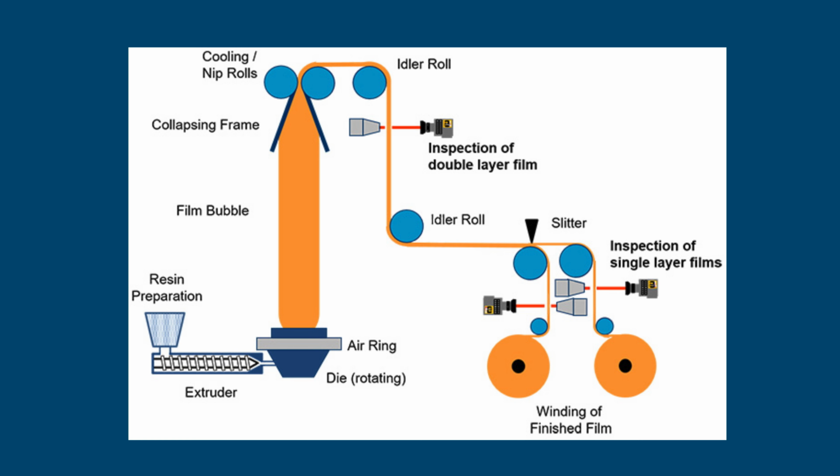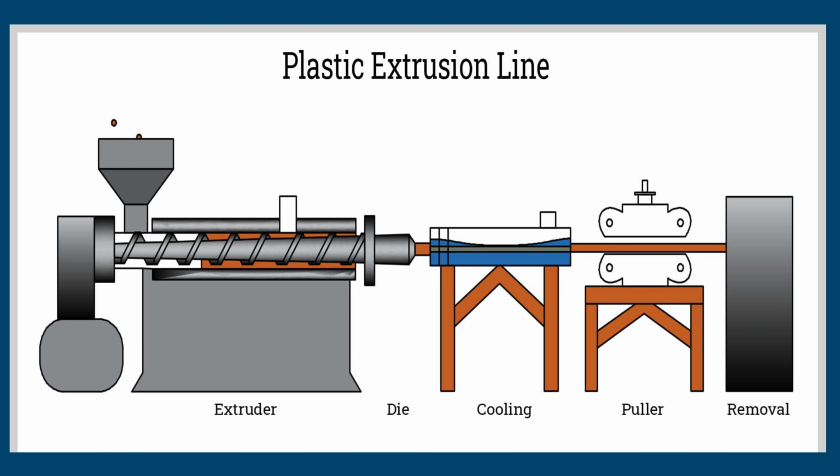Extrusion is one of the most important and widely implemented industrial techniques for producing polymer films, particularly for large-scale, continuous manufacturing. It is a melt processing method in which polymer materials are heated, melted, and forced through a die to form films of controlled thickness and width. Due to its high productivity, scalability, and compatibility with a wide range of polymers, extrusion plays a central role in packaging, electronics, and functional film industries.